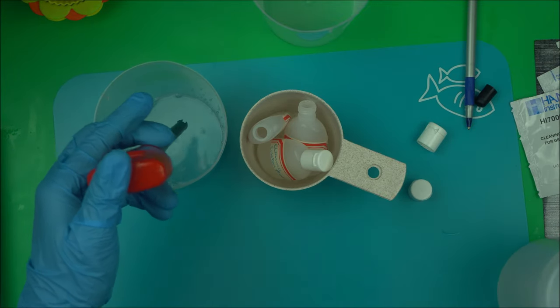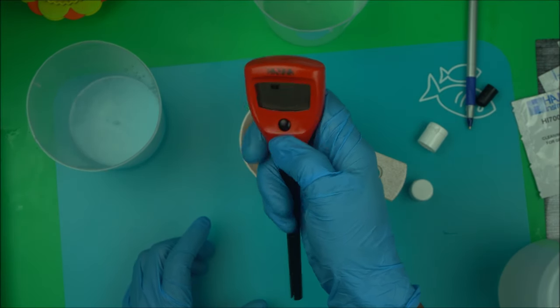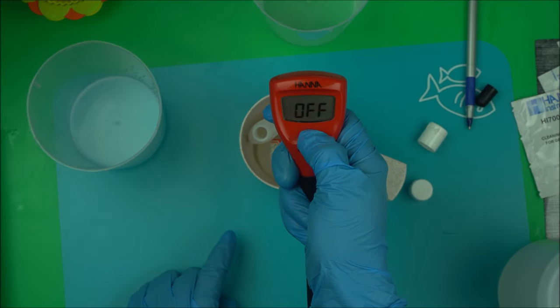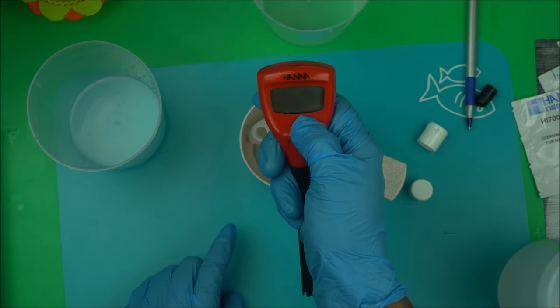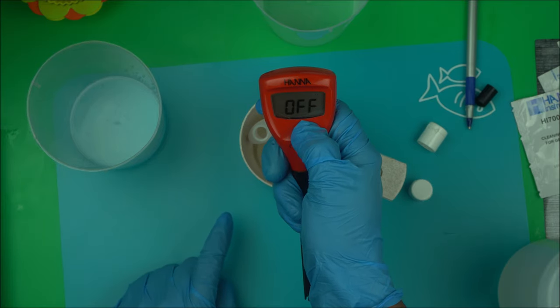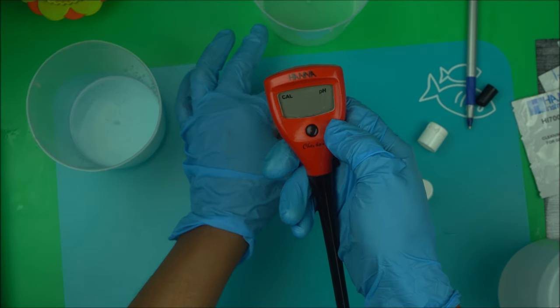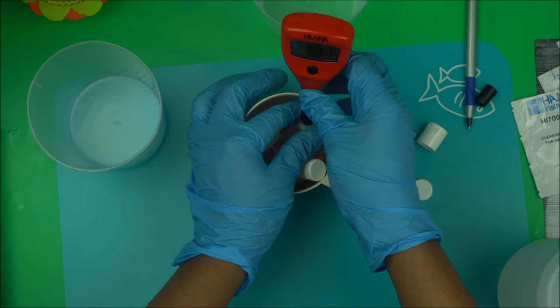Once the tip is clean, turn on the meter. When you see the reading, press and hold the button. It's going to prompt you to put it in the 7.01 buffer solution — put it in the 7.01 and wait for the readings.